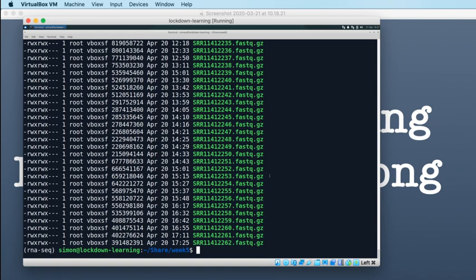I could also MD5 sum these, or SHA-256 sum them, and put those hashes up as well for people to check against, to make sure that you've got the same data. If what you've got is not the same as mine, then if you rerun the prefetch script, the get SRA robust script, it shouldn't do any unnecessary work. If you run it in the same directory that you were in before you did all this tidy up, and I'm sorry if you've done the tidy up and I'm telling you to do this subsequently, it won't do any unnecessary work. It won't re-download SRA files that are complete, for instance, but it will download them if they're incomplete. So it's worth running that again to check that it's got no work left to do.